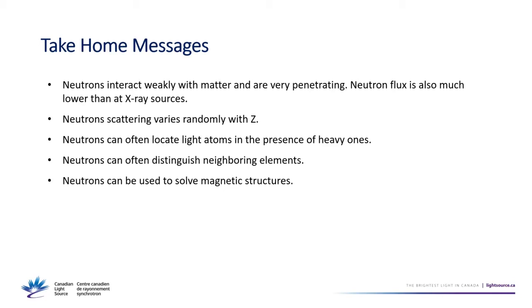Questions for Graham? Sure. With preparing a sample for neutron scattering, because of issues with how you can have effects due to different isotopes, how isotopically pure does your sample need to be to avoid any complications?